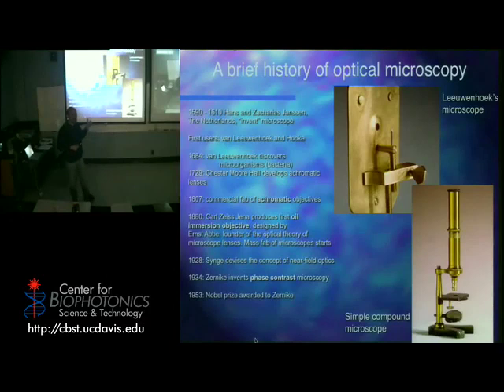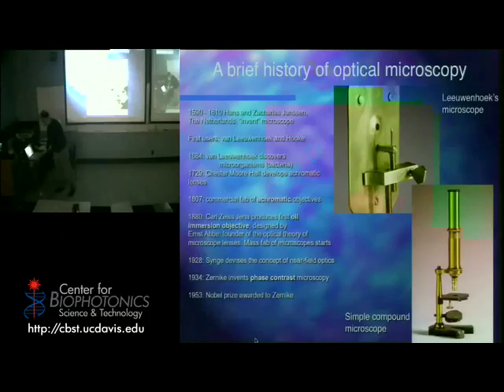And what do the new techniques do? They allow you to see things better. They create contrast. Pretty much in microscopy, what you're trying to do is see something well. So the push has been to seeing things that are smaller and smaller, while still alive, because that's the beauty of optical microscopy. You can see things alive. And the other has been to get contrast somehow, to get information about the thing that you're looking at. Structural details. That's been where things have gone.